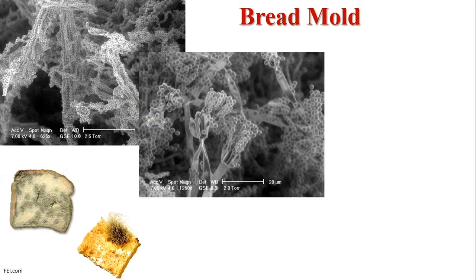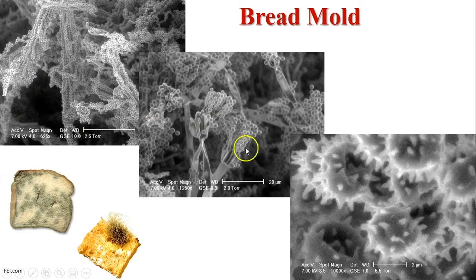However, if we further increase the magnification, because of the resolution of SEM, we can see a lot of detail on the surface. The surface is not smooth, and has a lot of spikes. So SEM can definitely provide more detail and significant information.